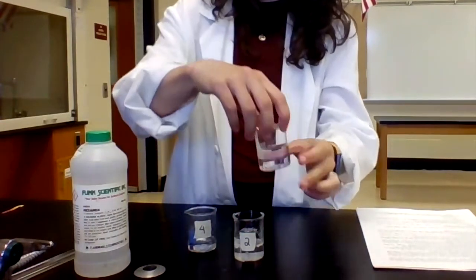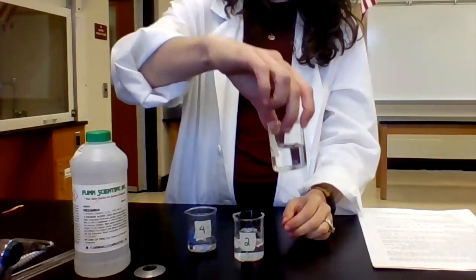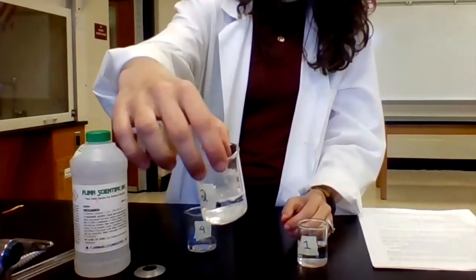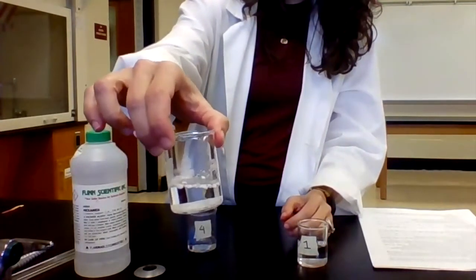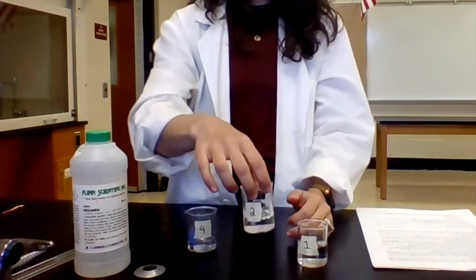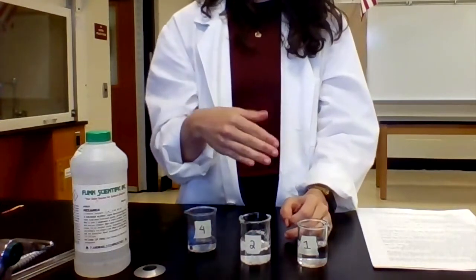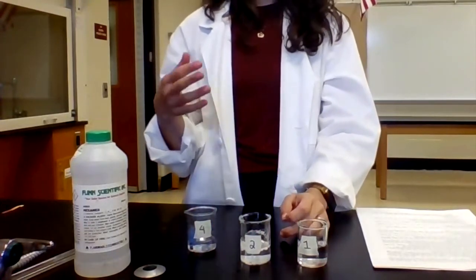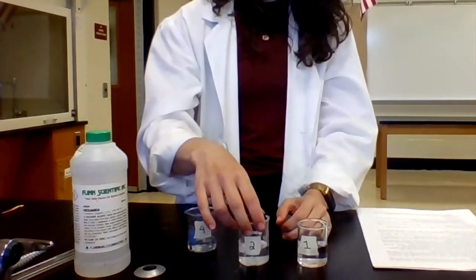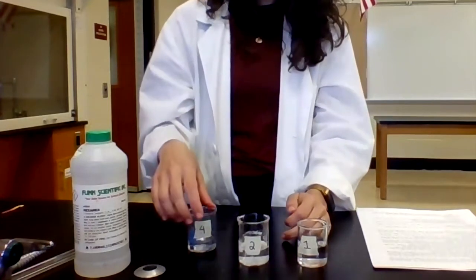And what we can see is that solid 1 very much dissolved in the water. Solid 2, some of it dissolved, but we still see a lot of solid floating around. So this really only has moderate solubility in water. So while it is likely polar covalent, it might have some non-polar parts to its molecular structure, and those are just not dissolving in the water.